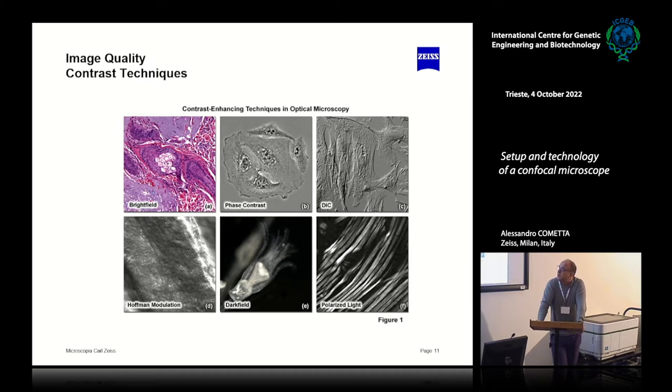Jumping to the image quality, why do we use fluorescence? Professor Bai told you a lot of things, so I will skip some parts, but I want to think a little bit about contrast. In an image we need details.